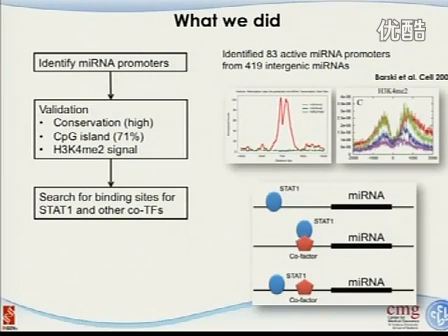Okay, so STAT1 binding sites have 3 different potential models. The first one is STAT1 binds in the promoter and does the regulation. The second one is STAT1 actually sitting on top of another factor, and the third one is doing it like this. And in our data, we want to see which model really works. So if the first happens, we will see a STAT1 binding site in the promoter region. If the second happens, we will not see a STAT1 binding site in the region we identified. Rather, we will see the binding sites of another factor, which we don't know at this stage.